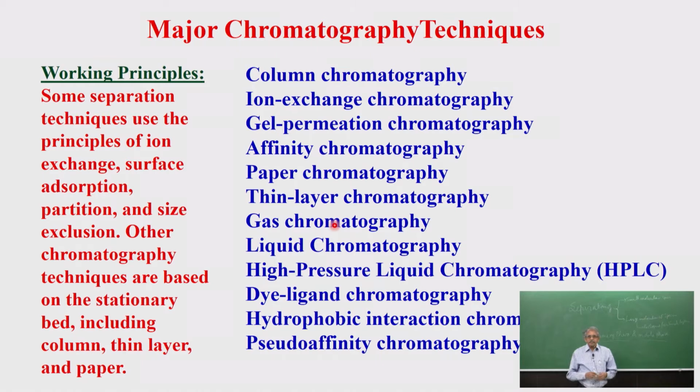Gas chromatography. Here we are not referring to the stationary phase; we are referring to the mobile phase itself. The stationary phase is a solid, but you can apply a gas and convert your compound into a gaseous state. That gas is then carried over the stationary phase so that a separation takes place. Liquid chromatography: just like that, you use a liquid, or a combination of liquids, depending upon their polarities or various other properties, that would bring a differentiation between your compound and the impurity.